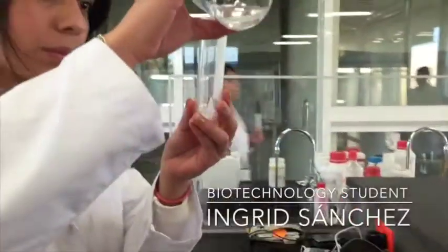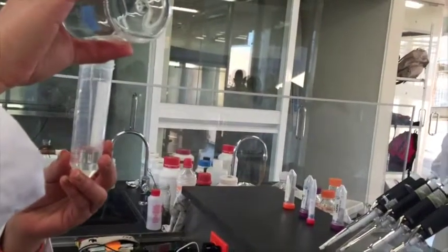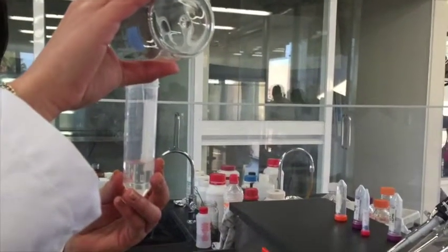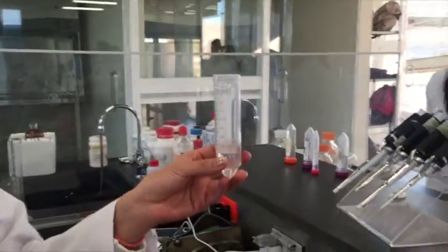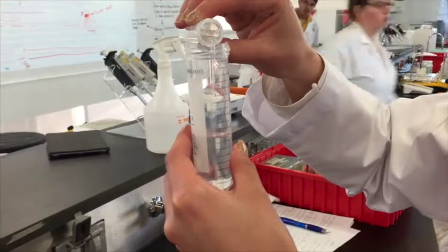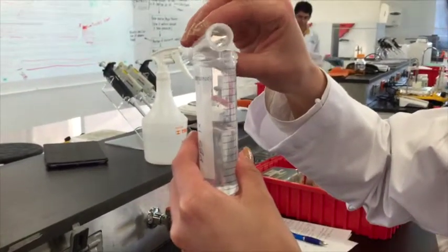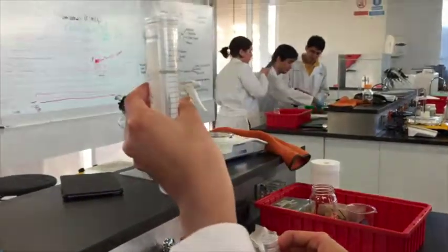The methodology we followed for having 30 milliliters of ethanol at 70% was: in a container, we measured 21 milliliters of pure ethanol, then we added 9 milliliters of distilled water. We closed this container and mixed it to have a homogeneous mixture. Finally, we labeled the container and gave it to the professor.